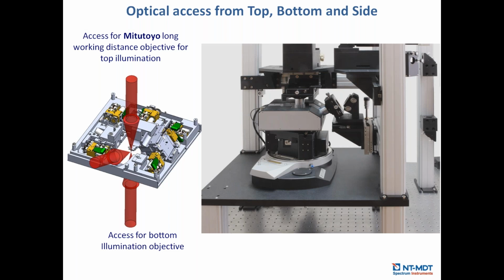It's important to be always in focus, and then the Raman signal depends mainly on the material properties, not on the topography. But if you go away from focus, then due to the confocal scheme, we lose some of the signal, and the intensity variation appears not because of the concentration or the material properties, but just because of defocusing of the optical scheme. So if you do not use the AFM feedback loop, yes, there is an effect on the Raman.